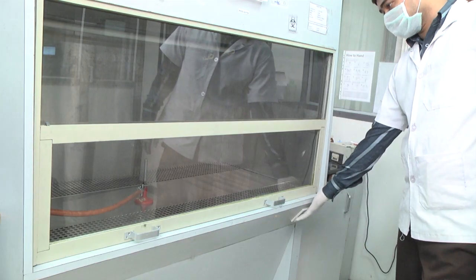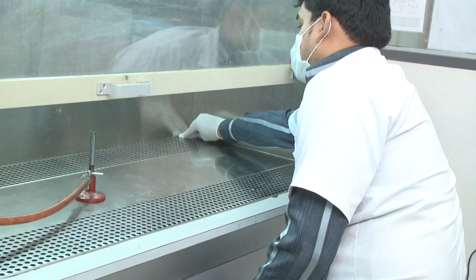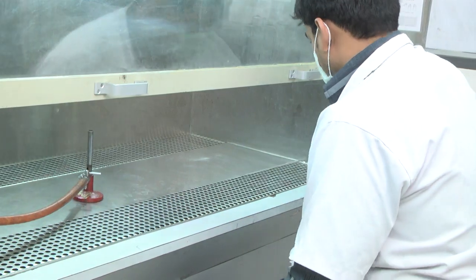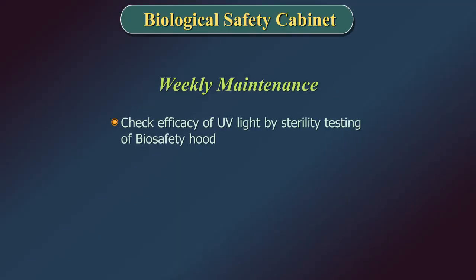Check for any residual LPG left in the rubber tubing after closing the gas cylinder. Put on the UV light at the end of day for 30 minutes for decontamination before shutting down the machine. Clean the front glass door and the surface using a domestic cleaning solution.